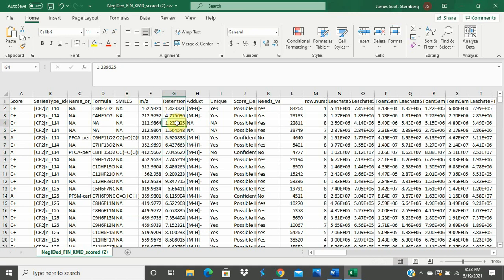This could indicate that these are branched or straight chain isomers or false positives, which would not belong to this series. In this case, because the mass is slightly off from 5 ppm tolerance on our instrument and they don't follow the retention time order, they are likely false positives and do not belong to this series.